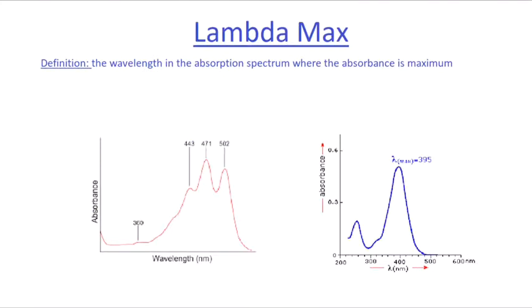Lambda max is the wavelength that gives the highest absorbance. Here are 2 examples of graphs that show scanning across all wavelengths. The highest peak is the lambda max. As seen in the examples, using the wrong wavelength or a shorter peak will result in an inaccurate absorbance.